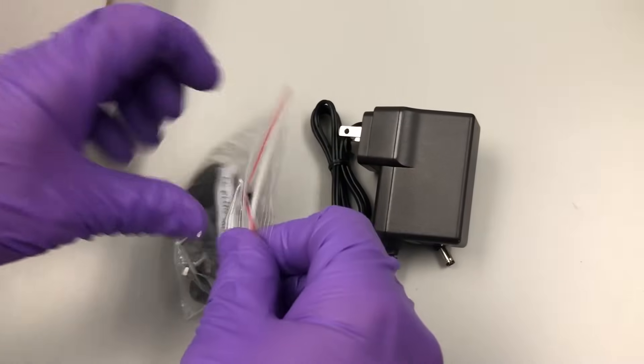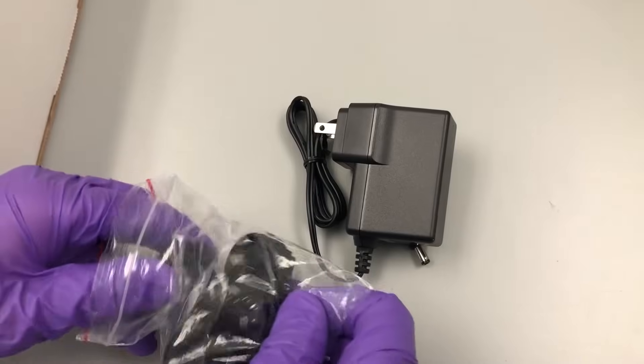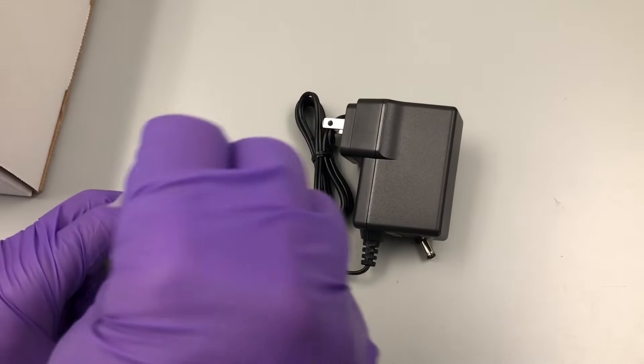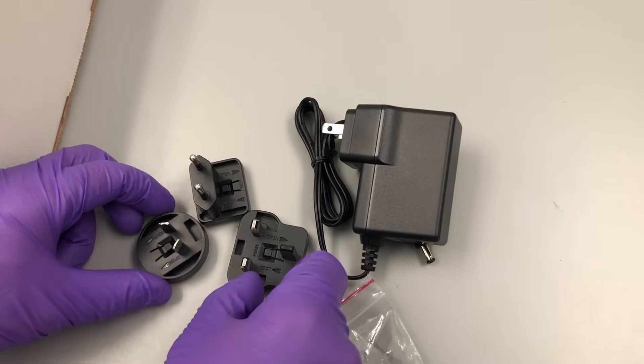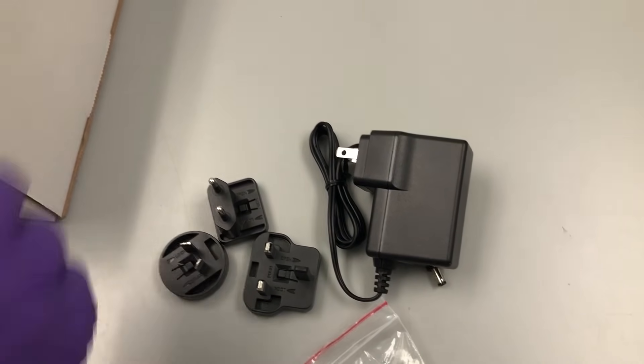The photoredox box also includes an international power adapter for the integrated fan unit which includes three additional adapter clips for type C, type G, and type I outlets.